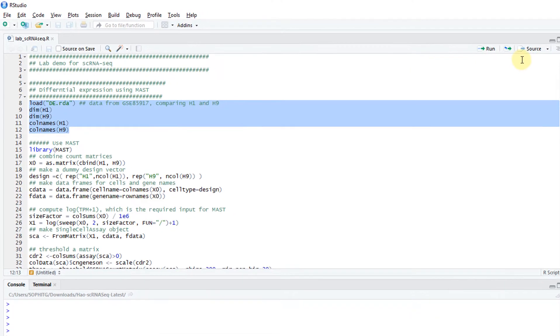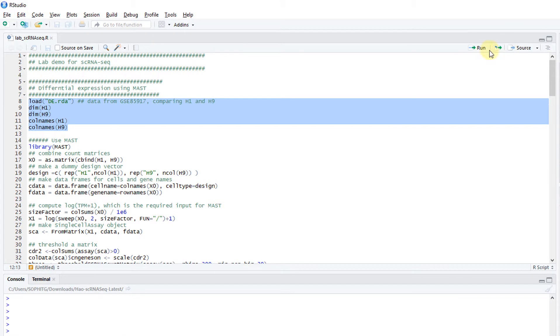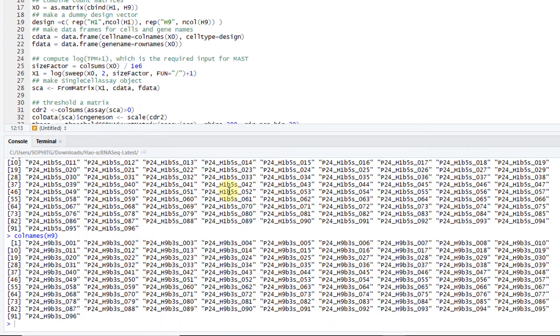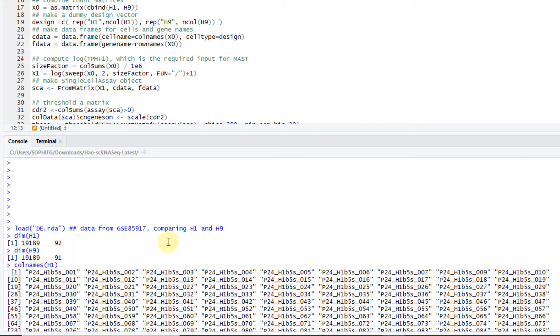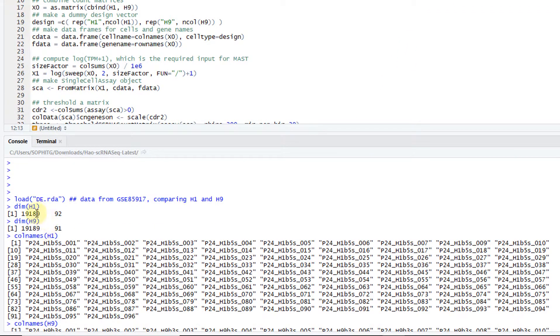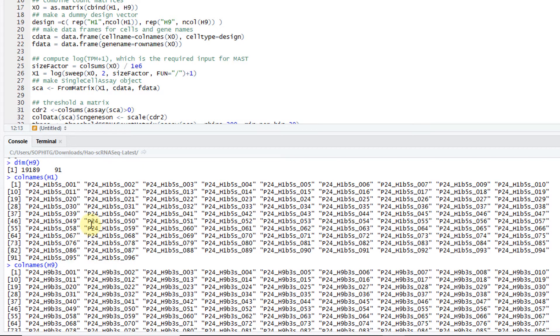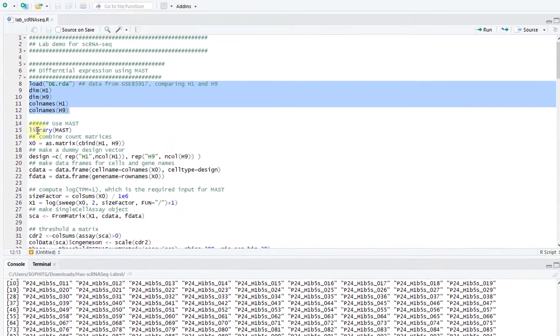If you just load it in and look at the column names, basically each one has about 20,000 rows. Each row is a gene and 90 something columns. Each column is a cell, a single cell.